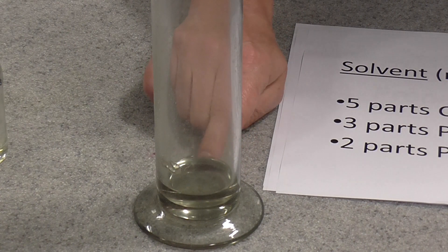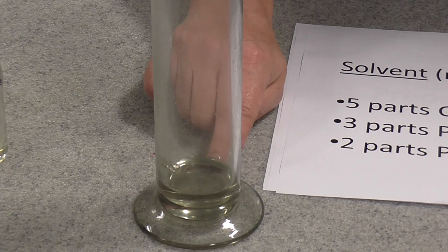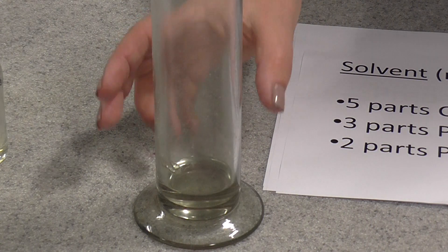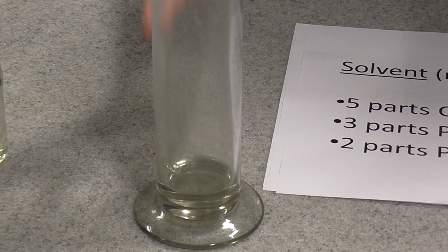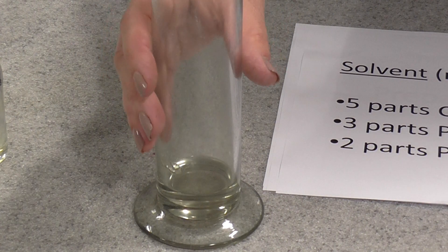You need to put a little bit of that, about a centimeter deep at the maximum, into the bottom of your gas jar and put the lid on so that it's quite volatile and you'll get the vapors collecting in here.